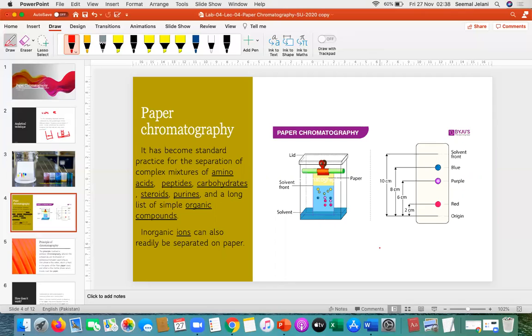So आपका task क्या है इसमें, क्योंकि जो 100B के students थे, they did in the laboratory. Okay, so they have the strip of chromatography result. Now what you do, you copy this thing, you take this portion, okay, this is the portion, right? You take this portion and draw something like this. Do not go for the cut and paste. I need it to be done with handwriting, okay?